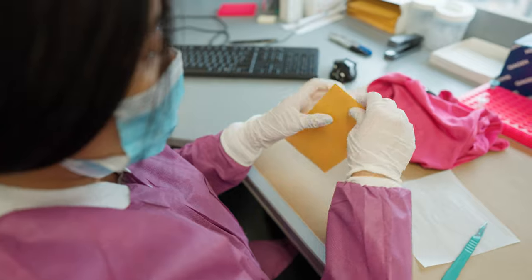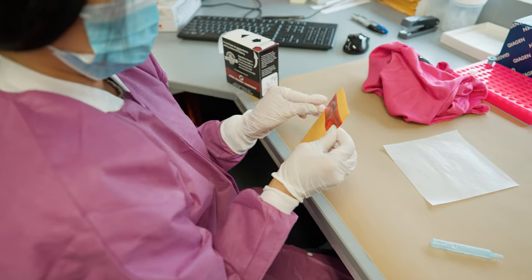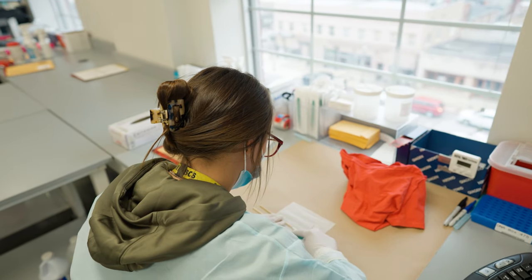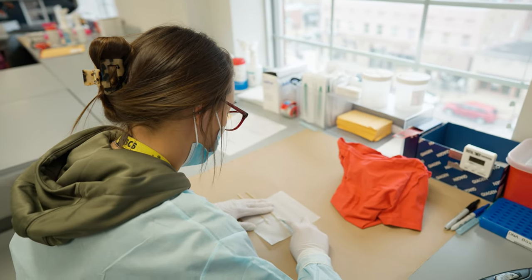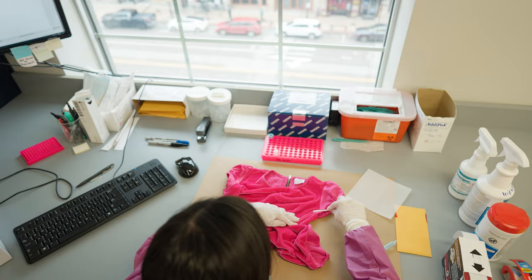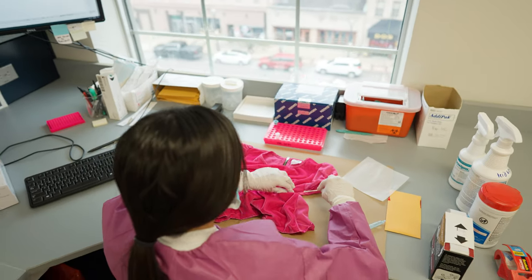A portion is then placed into a tube which will then go through the DNA process. You will learn more about that soon. The cases in biology take a few hours to a few days to complete depending on how much evidence is submitted. Despite what you see on CSI, this all takes time.